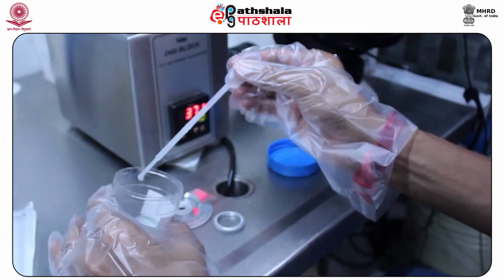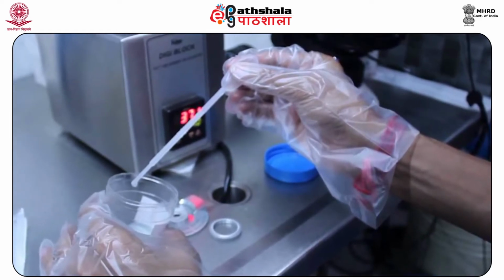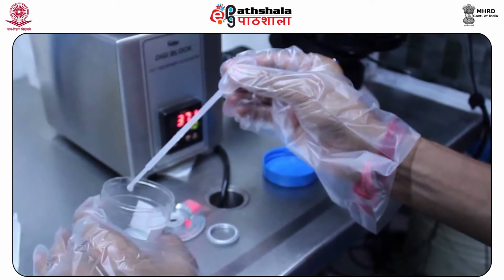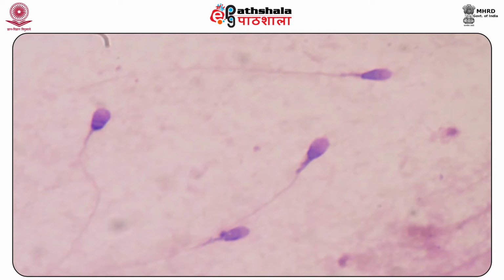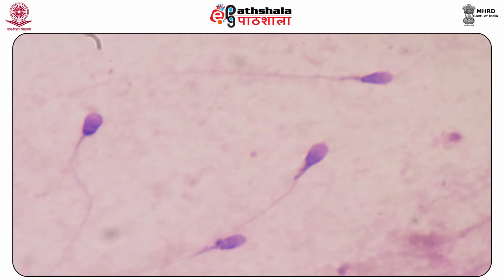Thus, by applying the test, a suspected azoospermic or vasectomized person who is a suspect of sexual offense may be identified. Stability of acid phosphatase activity in seminal stain depends on the temperature.